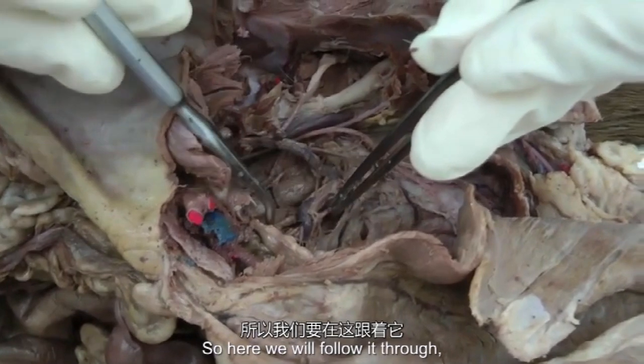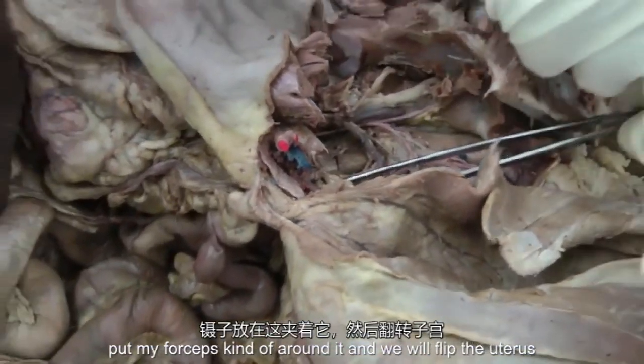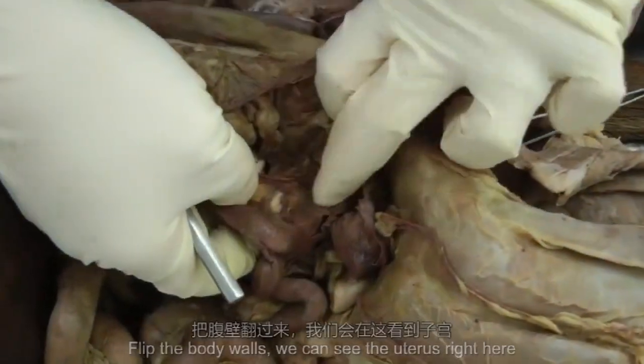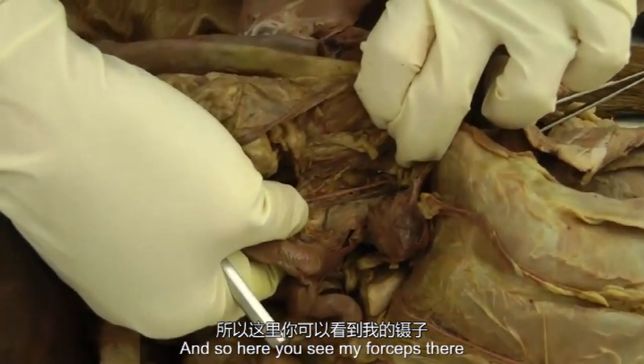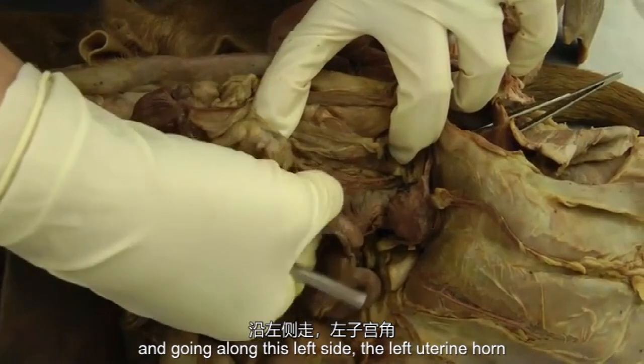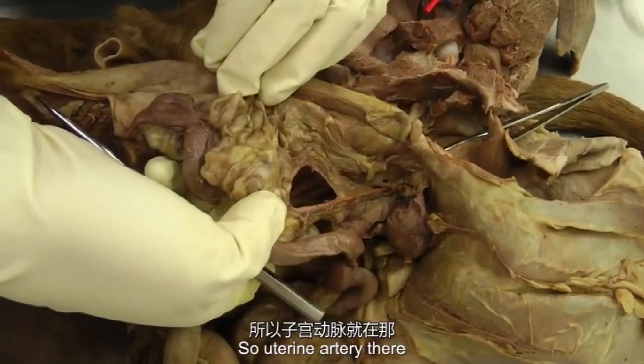So here, we'll follow it through, put my forceps around it, and we'll flip the uterus, flip the body wall so we can see the uterus right here. Here you see my forceps, and that is that uterine artery coming out and going along this left side, the left uterine horn. So, uterine artery there.